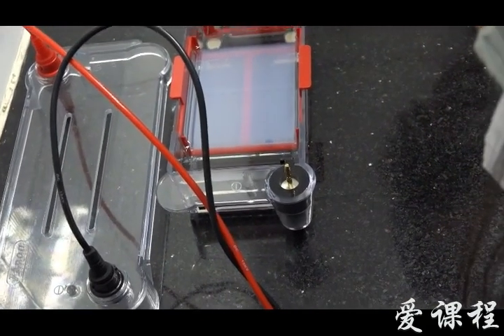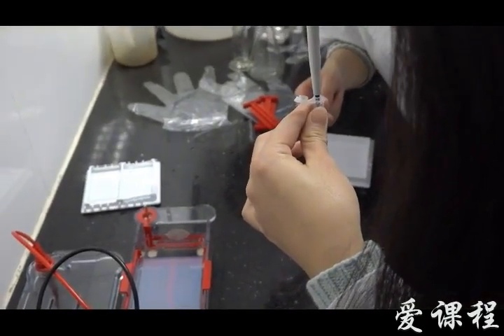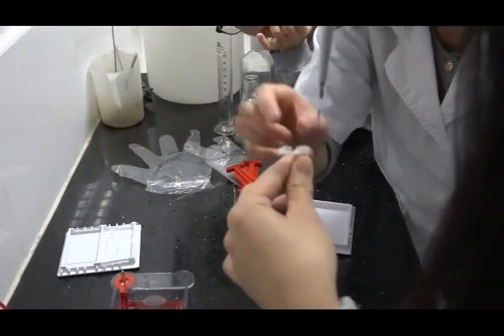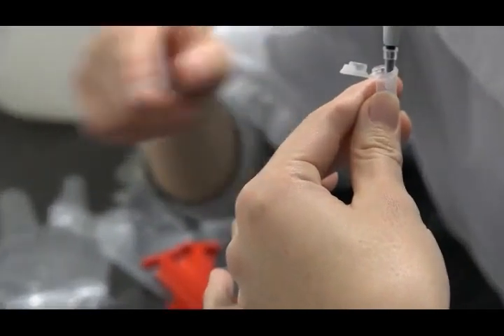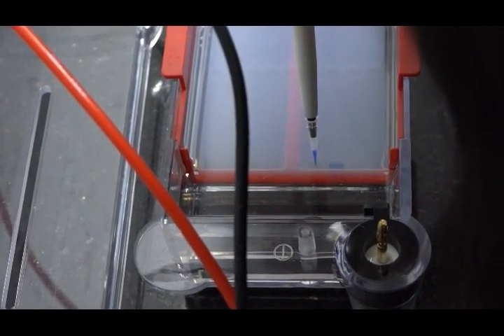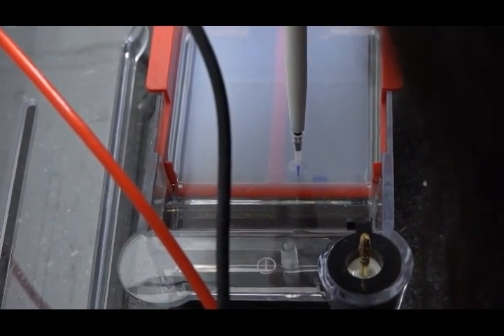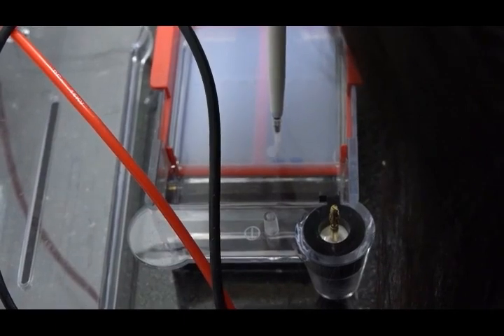Okay. Yeah, all of them. Maybe first you will add it twice. There are still some. It doesn't matter after you hide it. The first one, yeah. Do not touch the gel. Great. Yeah, 好棒啊!